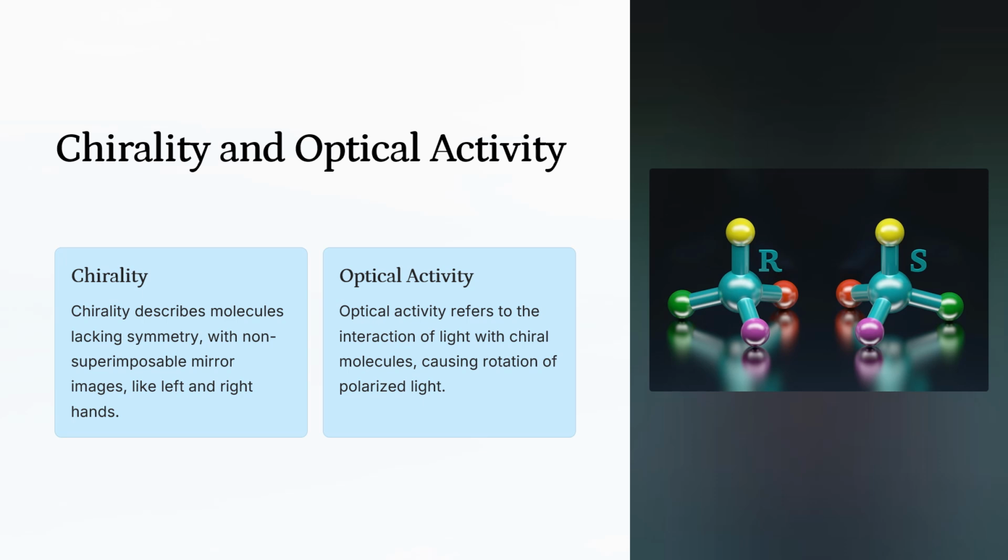The odd pairs include the little finger and thumbs of both hands, and the only even pair, or the matching pair, is the middle finger on top of each other. Other than that, our hands are chiral, that is, they are non-superimposable. The next thing is that these chiral molecules interact with light differently, leading to optical activity.